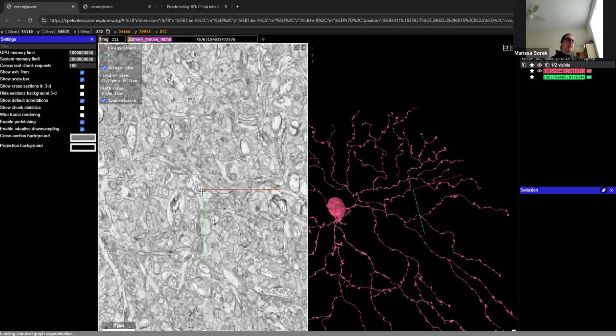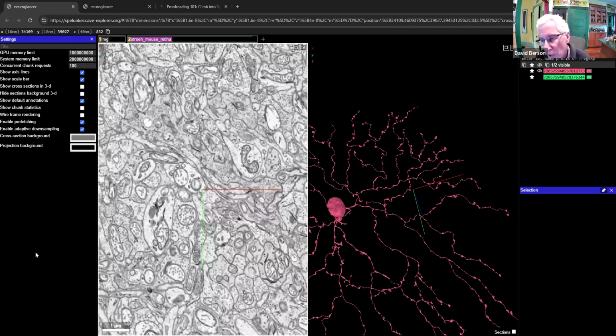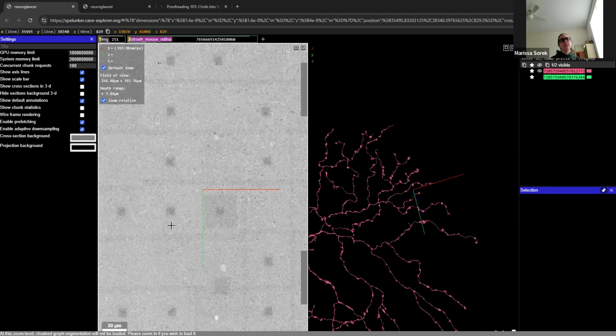We have a downsampled version of the EM, and that's specific to the Asia region, just so that way the EM will load faster for them. It's slightly poorer quality, a little more pixelated, but it will load faster if there's loading issues on that end. And when you're zooming out, you're presumably actually viewing a downsampled version? Yes, you are. You can kind of see that happening when I just zoom out, that it's already doing that.